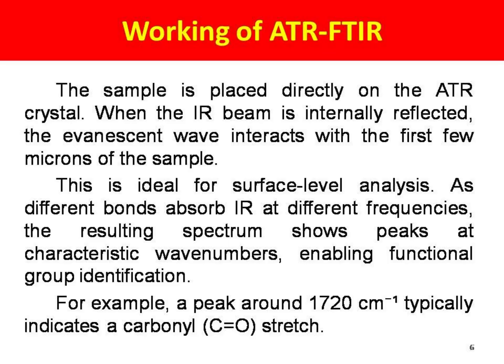This is ideal for surface level analysis, as different bonds absorb IR radiation at different frequencies. The resulting spectrum shows peaks at characteristic wave numbers, enabling functional group identification. For example, a peak around 1720 centimeter inverse typically indicates a carbonyl group.